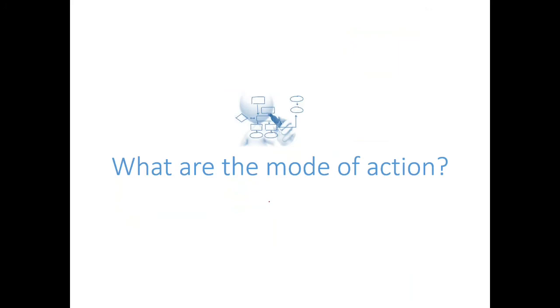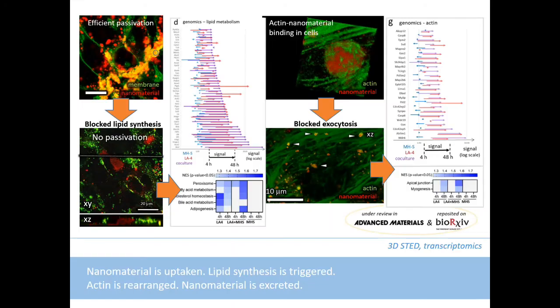So we used different approaches, especially super-resolution time lapse, to identify the mode of action. First, because we co-localize lipids and nanomaterial in the same place in these yellow aggregates, we were interested whether this is a consequence of a biological response. You might also remember that I said it is 2 days after the exposure.